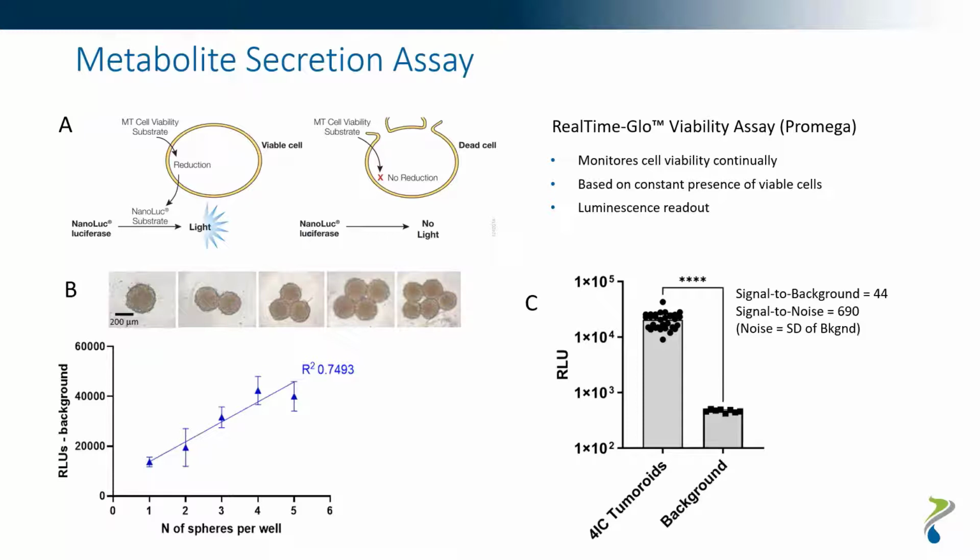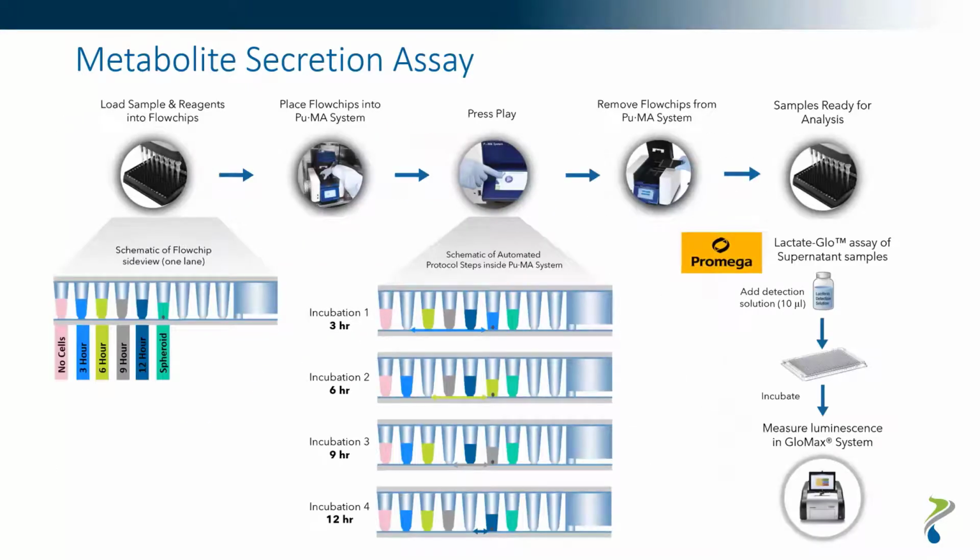This assay can be used as a data normalization factor at the beginning of the experiment. Here we demonstrate a novel workflow that we have developed to monitor metabolite dynamics in physiologically relevant patient-derived models.